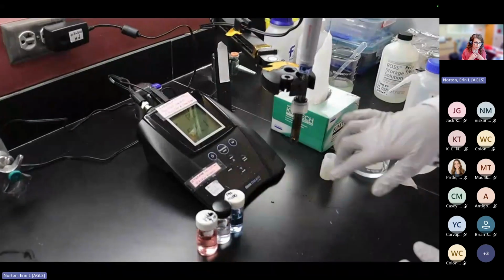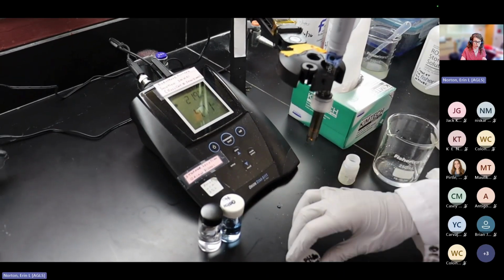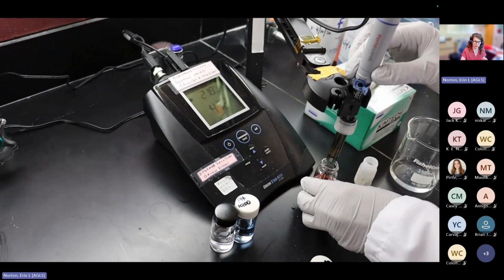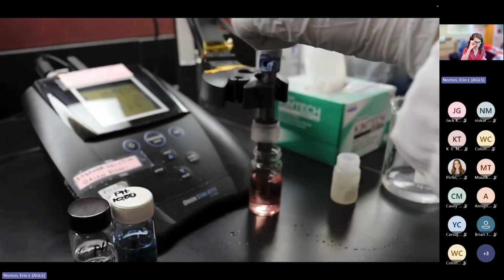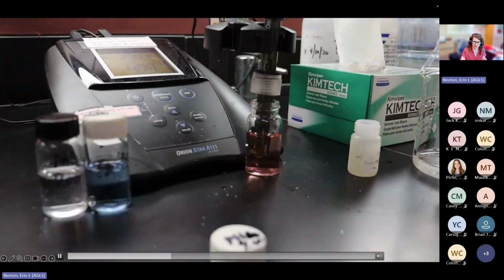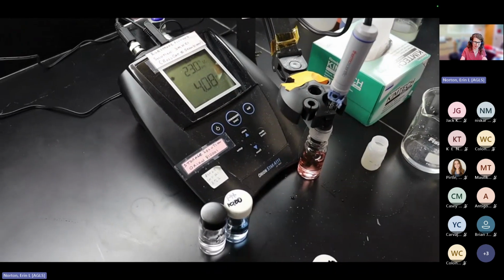So on our particular meter, we're going to hit calibration. We're going to start with our calibration standard, which is at 4.0. We submerge it, making sure that the bottom of the probe is fully submerged. That's what I'm trying to show here. And we're going to let the machine read that.